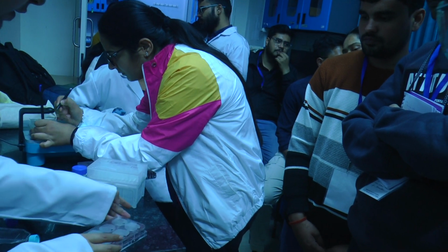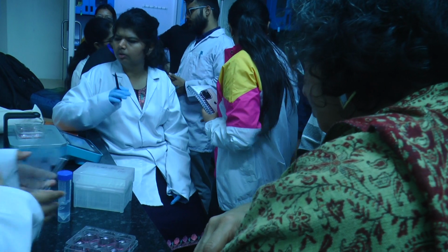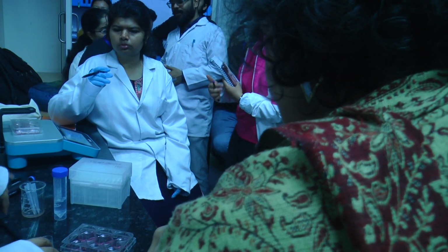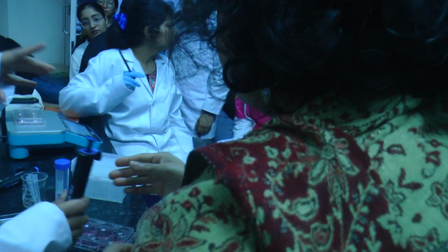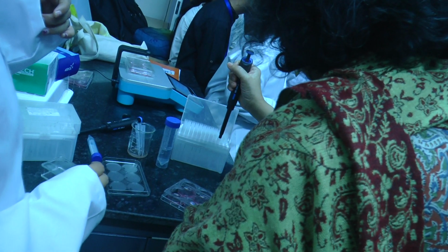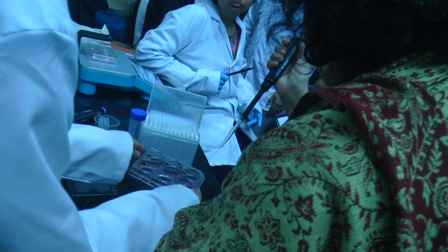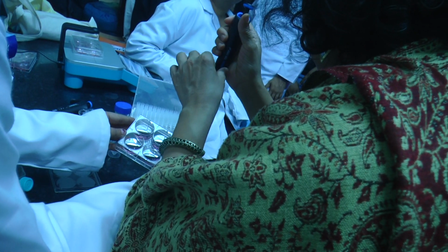So this you can do to start. Now you can start. So what do you want to do? This is yours, right? Firstly you have to remove the media. Tilt it a little less, like that, so that we don't touch the bottom.